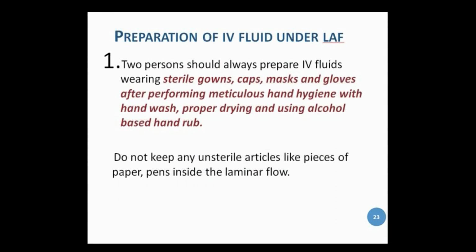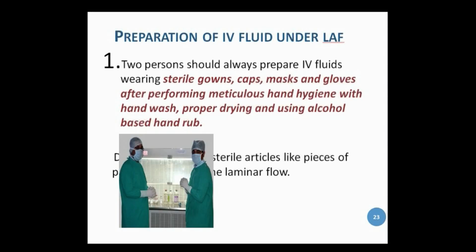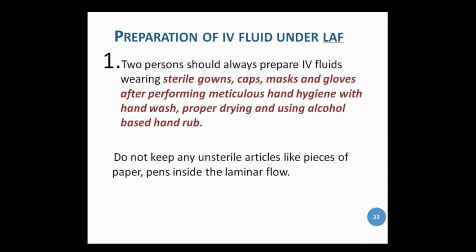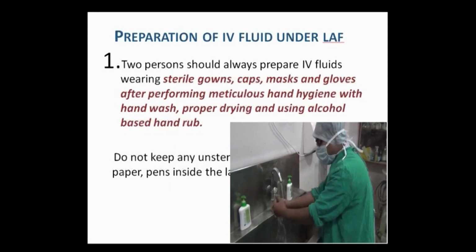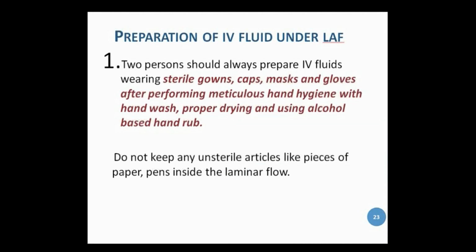For the next section, under the objective, we will show you how to prepare the IV fluids under laminar airflow. We'll go through a number of steps, of which step 1 is that the two persons who are preparing the IV fluids in the laminar airflow should always wear sterile gowns, caps, masks and gloves after performing meticulous hand hygiene with hand wash, proper drying and even using alcohol-based hand rub. Remember to not keep any unsterile articles like pieces of paper or pens.